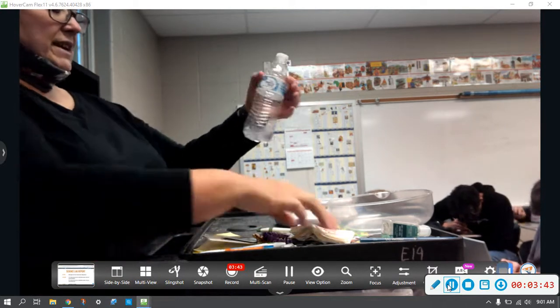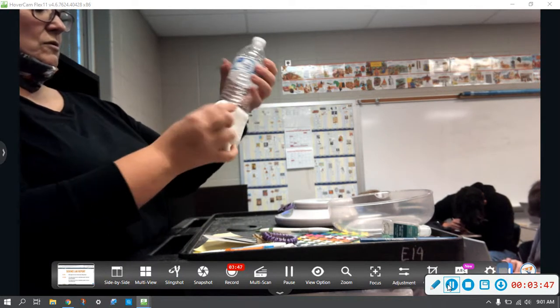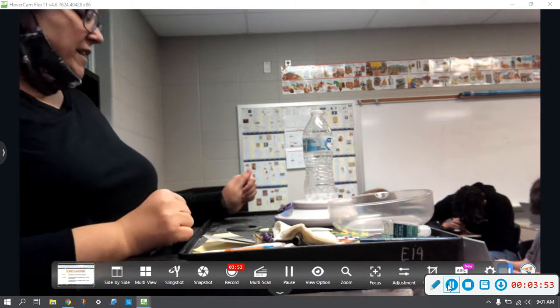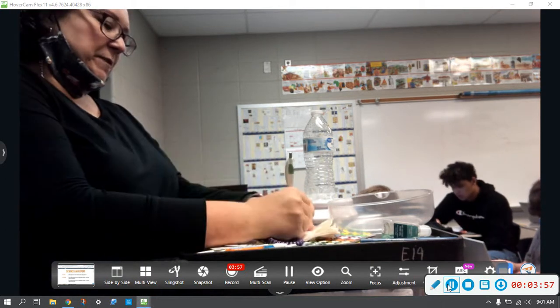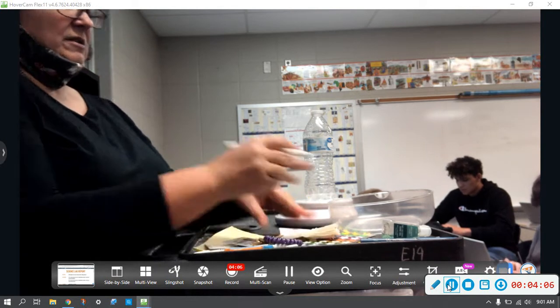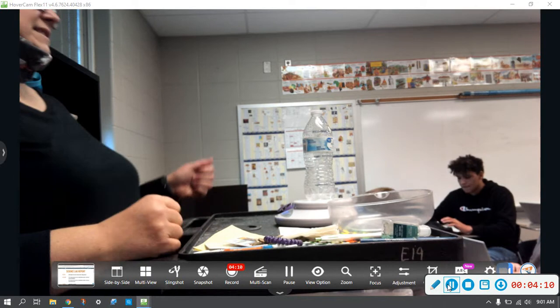I'm going to go ahead and weigh it a second time. Let's see what we get. It is 31.9 grams. So we went from 32.2, oops, it just went to 32.0. So 32.2 to 32.0 grams. Most of the mass comes from the bottle. Yes, it does.